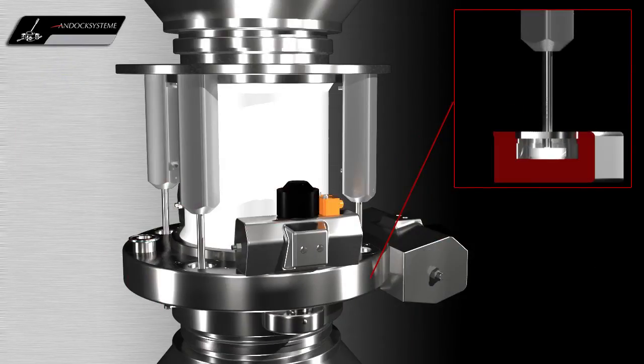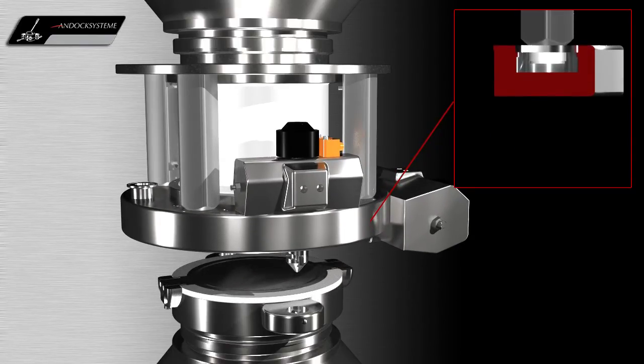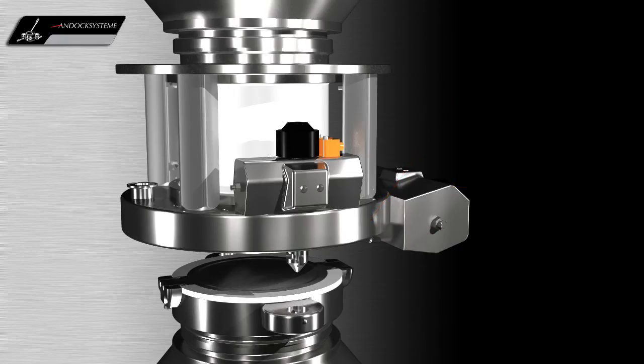After the vacuum sweep, the lift cylinders move the active valve back to its initial position. Thus, the decanting process is executed under closed conditions.